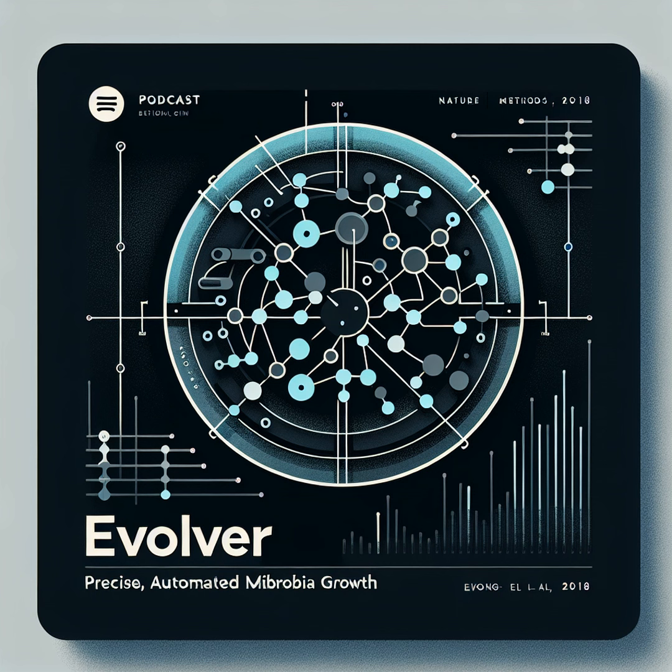One aspect that particularly struck me was their use of millifluidic multiplexing for tasks like automated vial-to-vial transfers. This allowed them to circumvent a major problem: biofilm formation. That's a significant advancement. Biofilm formation is a persistent problem in many long-term cell culture experiments, and this automated passaging approach represents a smart solution.